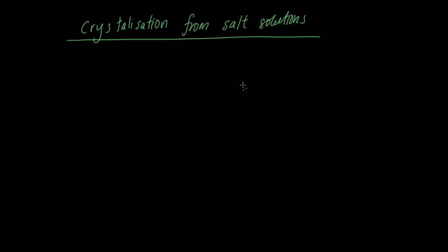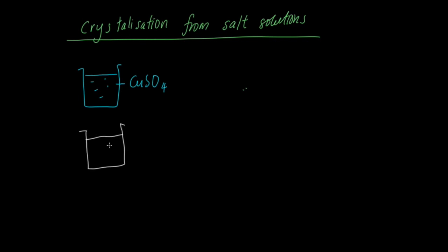Hi kids. Alright, so previously we already prepared an aqueous solution of copper 2 sulfate, which is a lovely blue solution. We also prepared an aqueous solution of potassium chloride, which is a lovely colorless solution. So these two are aqueous solutions.